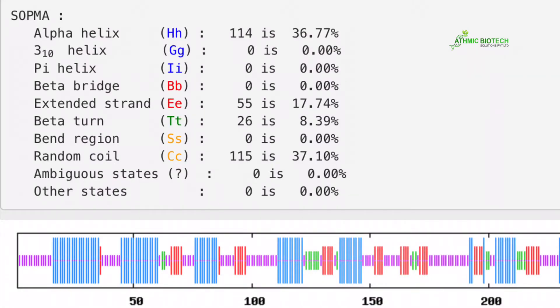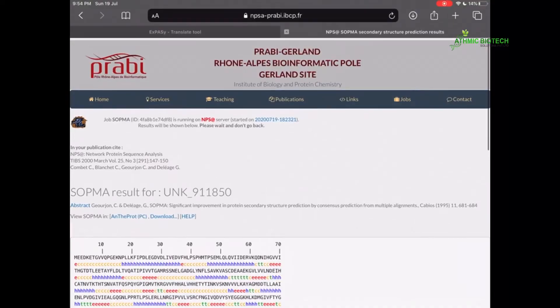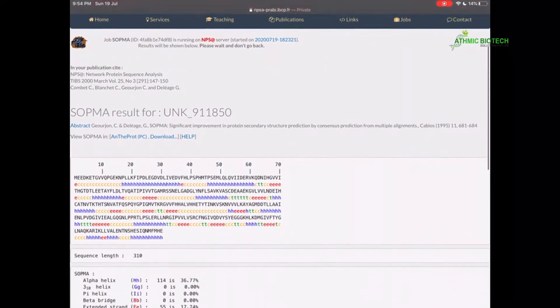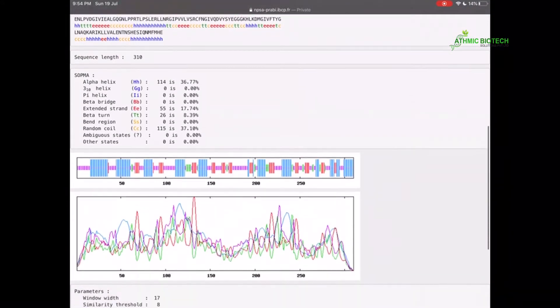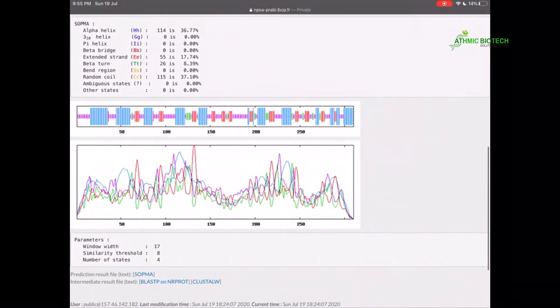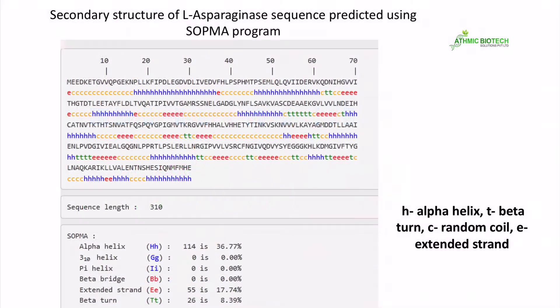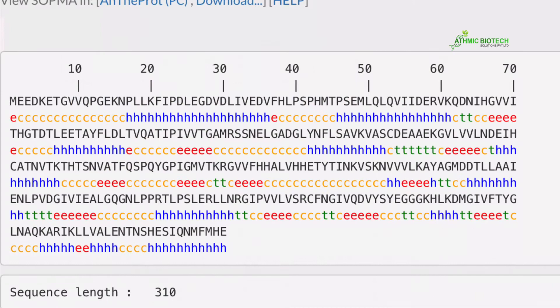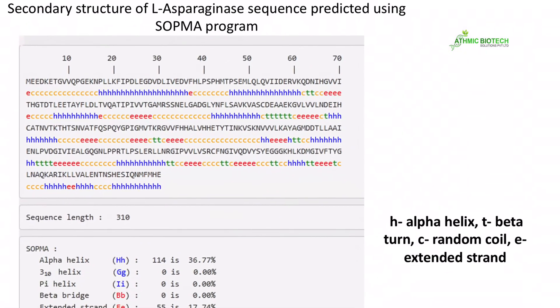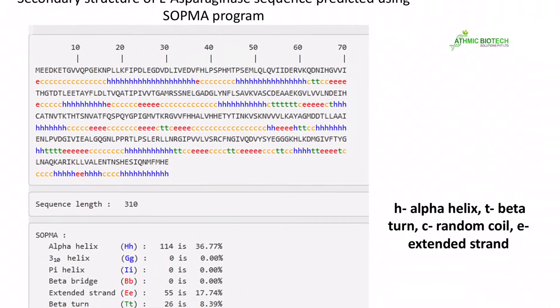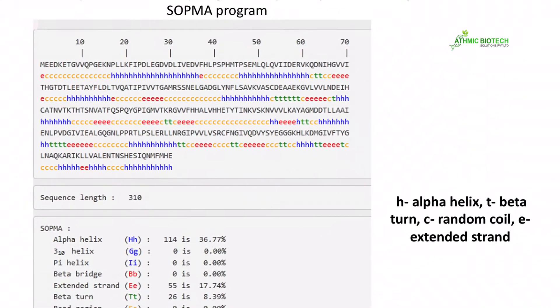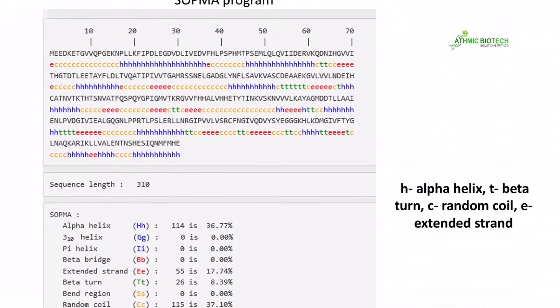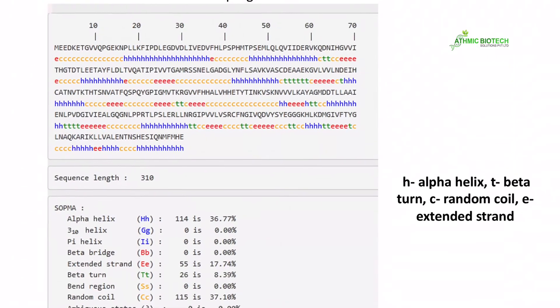And here you can see each amino acid in each position is contributing to each secondary structure. For example, the first amino acid methionine is part of E, that means Extended Strand. The next amino acid is part of C, that means Random Coil. H means Helix and T means Beta Turn. Thus, the entire secondary structure of the protein is predicted.